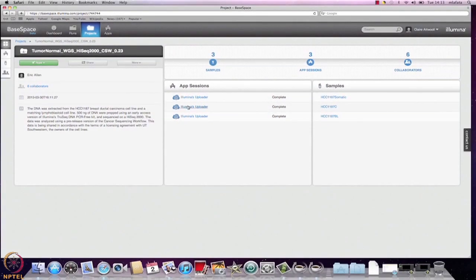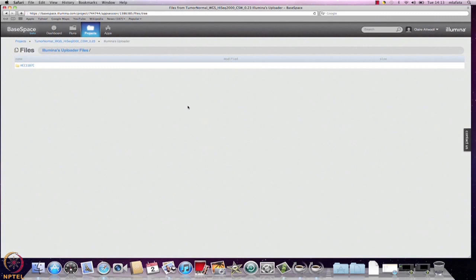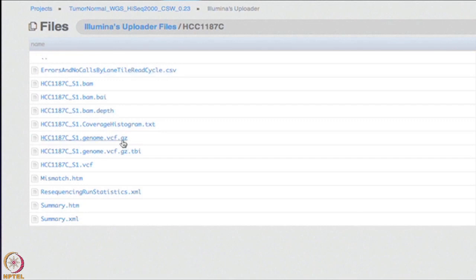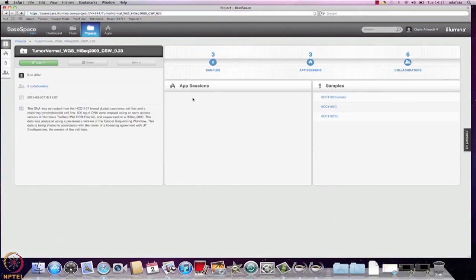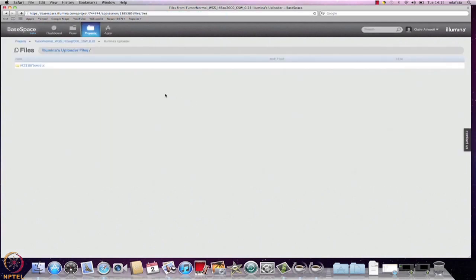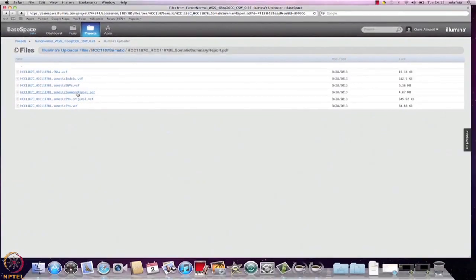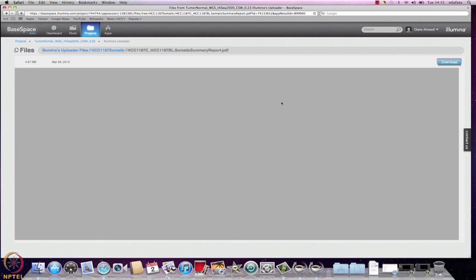Clicking on the hyperlinks will also show you the folder name. Inside the cancer and bloodline folders, you will find BAM files, VCF and genome VCF files, and there will usually be a summary report for the analysis. Inside the somatic folder are VCF files from the subtracted data, showing the variance between the tumour-normal data. There is also the somatic summary report, which you can open within BaseSpace or download directly to your computer.